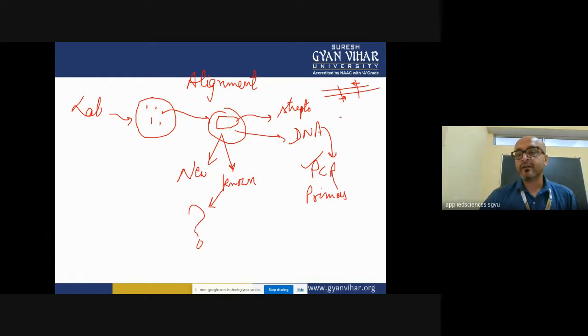Suppose you have taken the 16S rRNA sequence, or we take the ITS region, ITS1 primers, if it's a fungus. So I have amplified a small stretch of amplicon. What I get is a substantial amount of DNA of the selected region of an unknown microbial source.